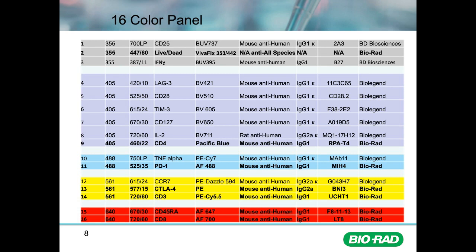Finally, T-cell associated cytokine profiles were evaluated. IL-2, TNF, and interferon gamma expression by T cells may influence the tumor microenvironment. These samples were collected using a 5-laser ZE5 Cell Analyzer, which allowed us to use a very small volume of precious sample for our analysis.